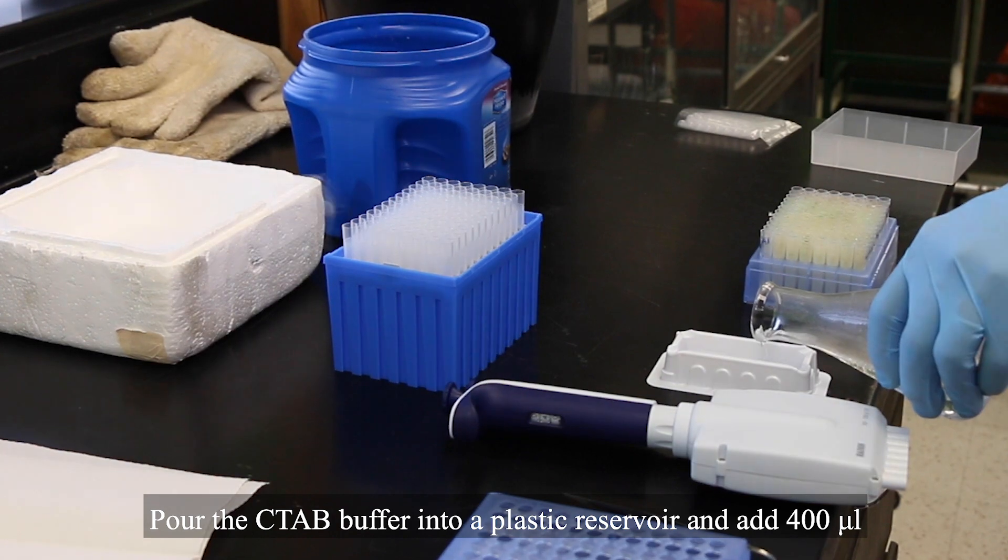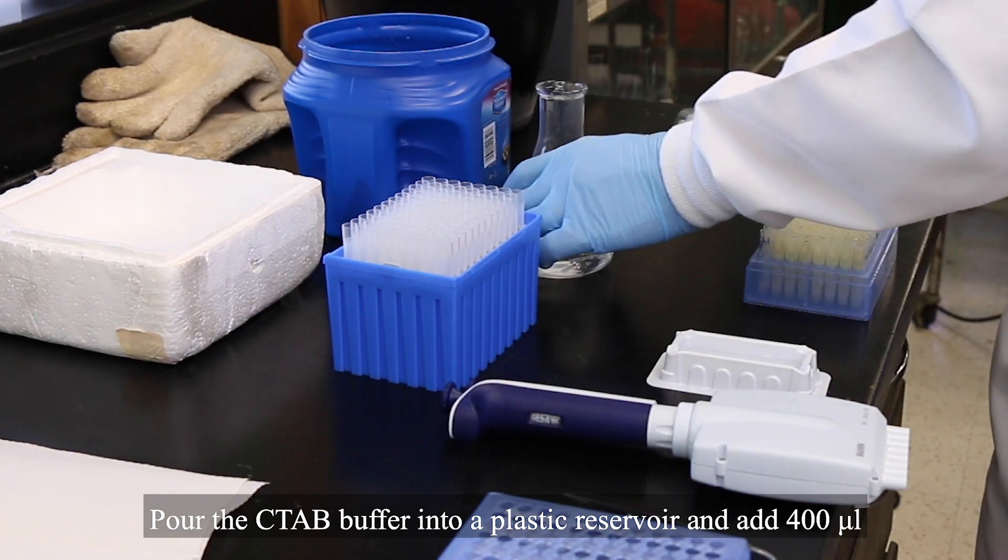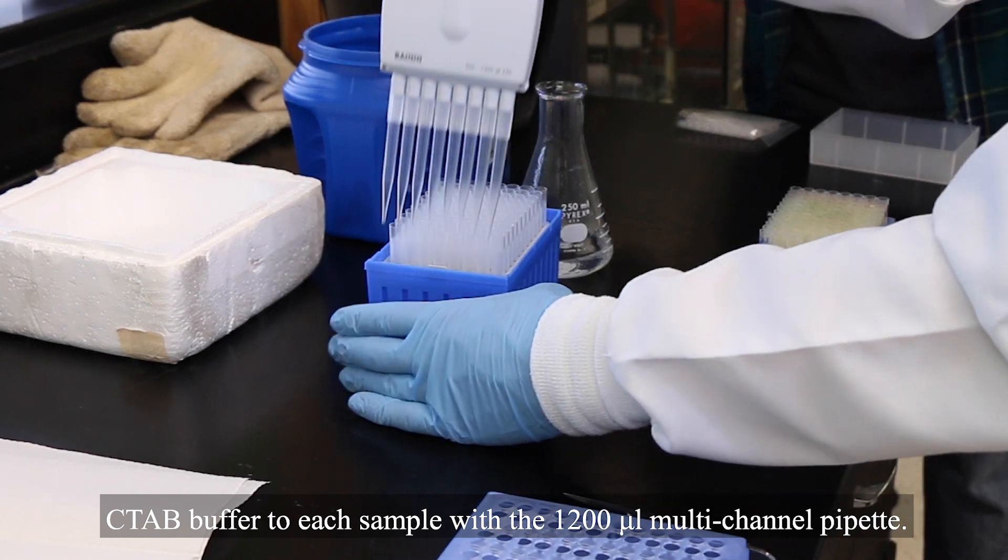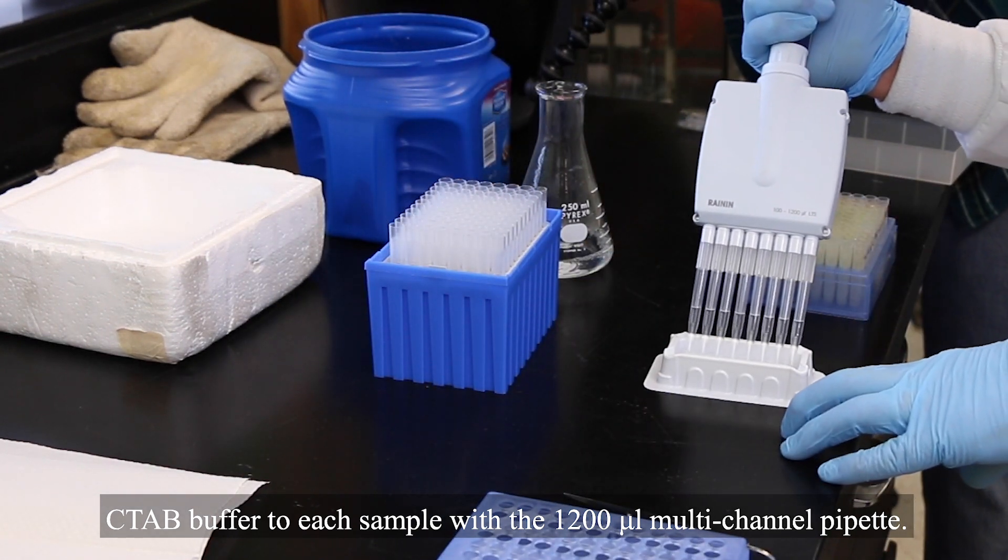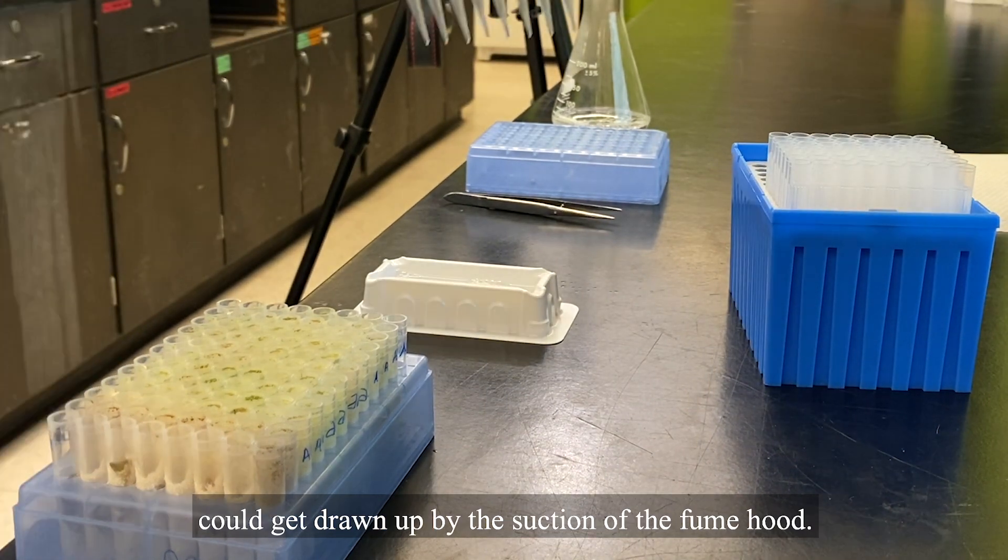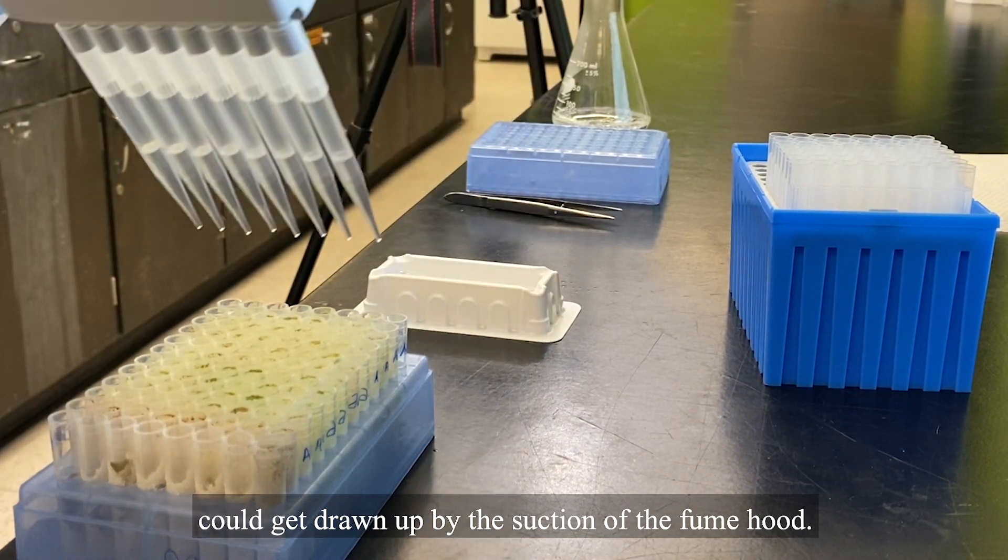Pour the CTAB buffer into a plastic reservoir and add 400 microliters CTAB buffer to each sample with a 1200 microliters multi-channel pipette. This should be done on the open lab bench as powdered tissue could get drawn up by the suction of the fume hood.